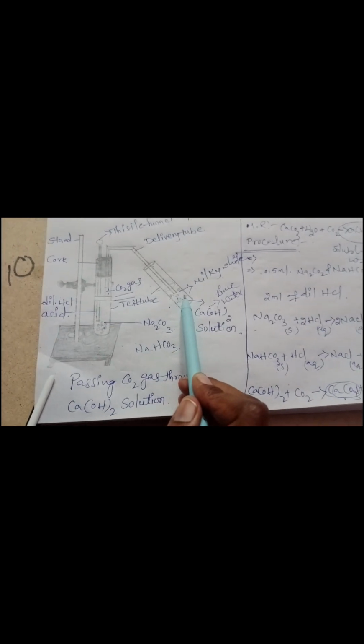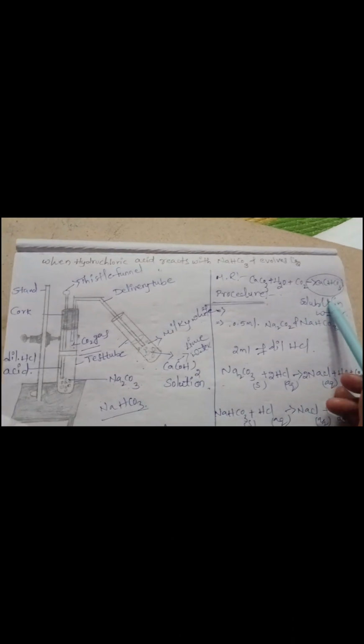Instead of sodium carbonate we can also take sodium hydrogen carbonate. At that time also we can observe the white precipitate. When sodium hydrogen carbonate reacts with hydrochloric acid, it releases carbon dioxide gas. When the carbon dioxide gas reacts with the lime water, we get calcium carbonate and water. When more carbon dioxide is passed through the calcium carbonate and water, we get calcium hydrogen carbonate, which is soluble in water.